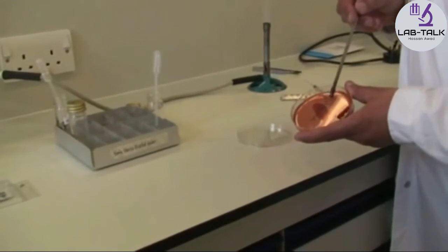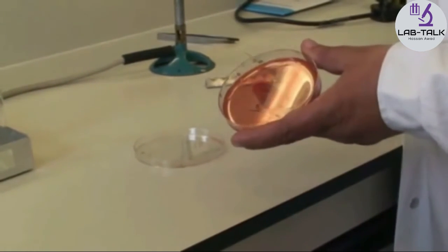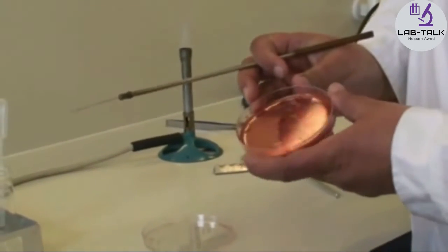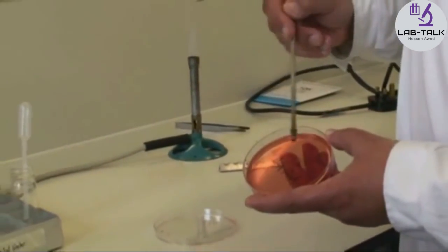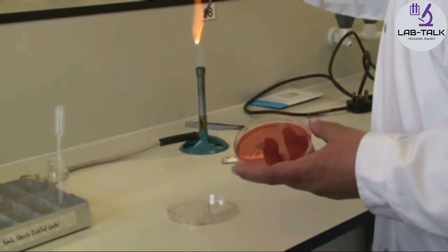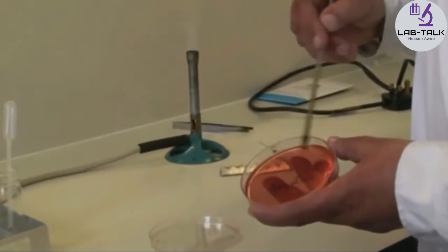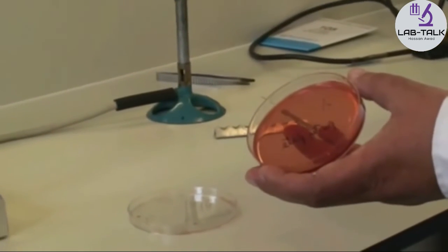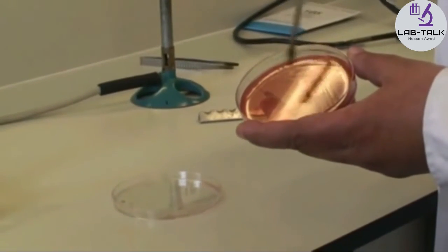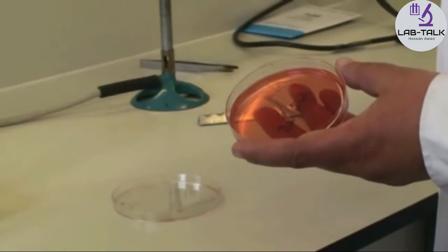Going back to where you originally inoculated, spread it out, then heat the loop each time. Move your plate around and take some from that sector to the next area — flame the loop, take a little bit more from that sector to the next area. Do that two more times so that at the very end you have nice pure colonies for further work if needed.